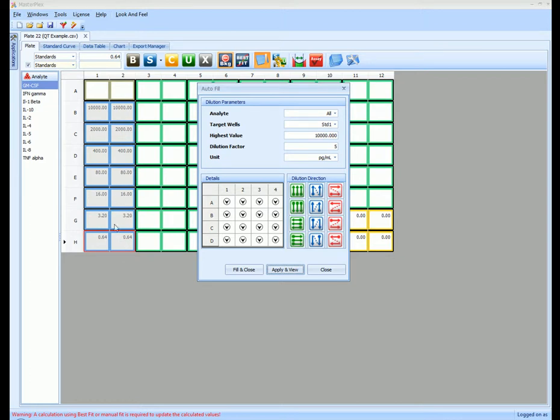So you can see the time savings here. If you had to enter each one of these values separately for each of the 7 points for each of the 10 analytes in this particular panel, and some panels are even more than 10 analytes, that could be quite time consuming.